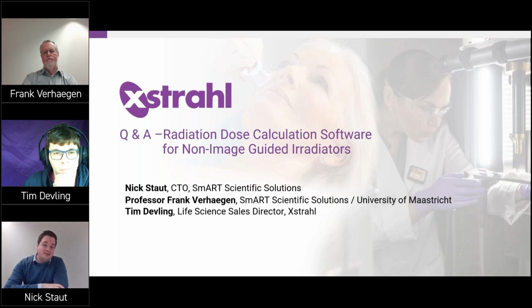If that dose rate changes, you obviously need to recalibrate SmART-RAD. We know the tubes on the CIX systems are very stable for a number of years, but we would always recommend a reasonable quality assurance timescale. It doesn't change, but you want to make sure it doesn't change. But as you say, if everything stays the same, the software should not need to be recalibrated either.